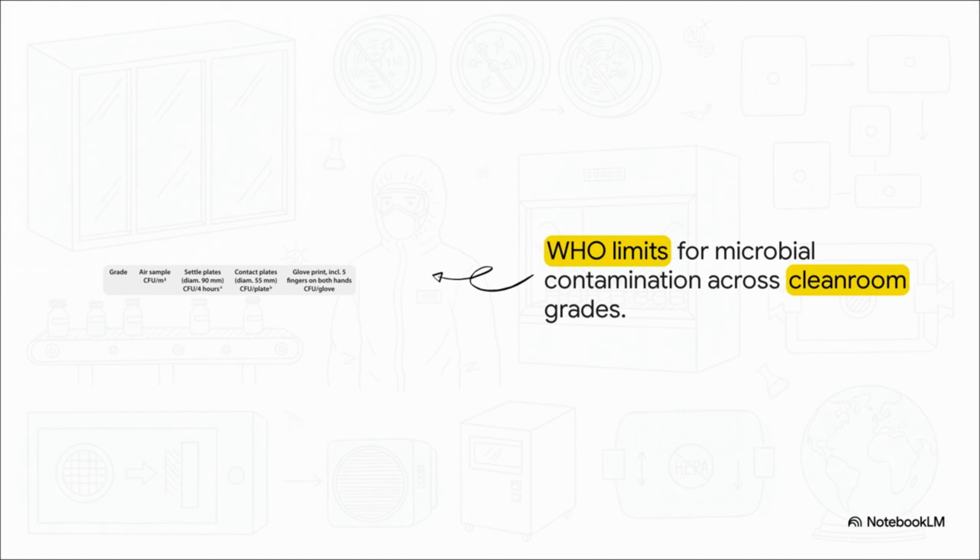Because of those incredibly strict limits, a single solitary viable microorganism detected anywhere in grade A is a complete breach of the fortress. It triggers an immediate full-scale investigation because at that point, the entire process is compromised.